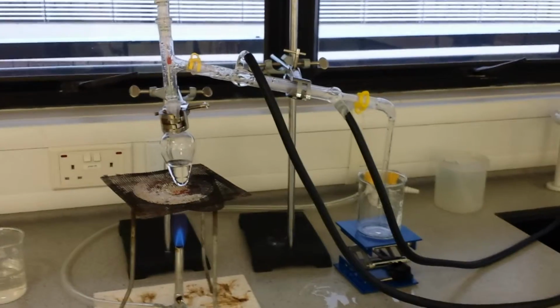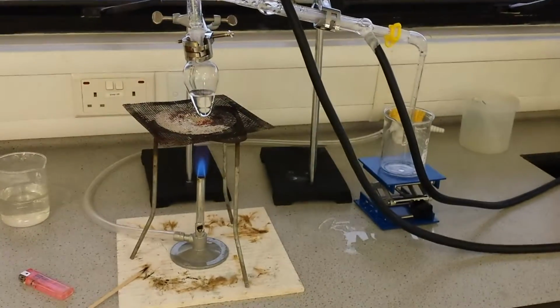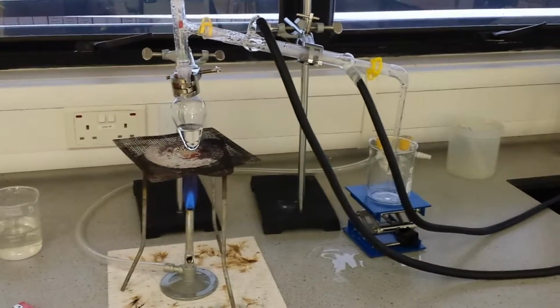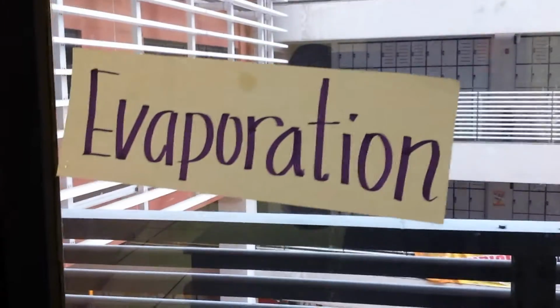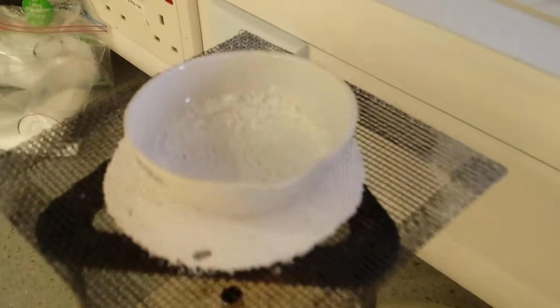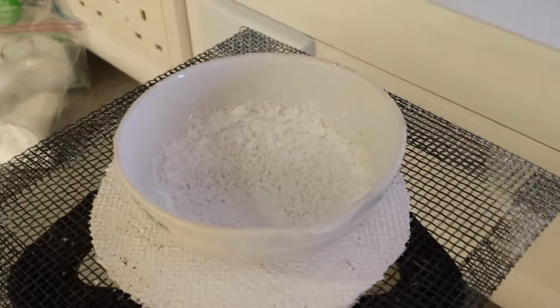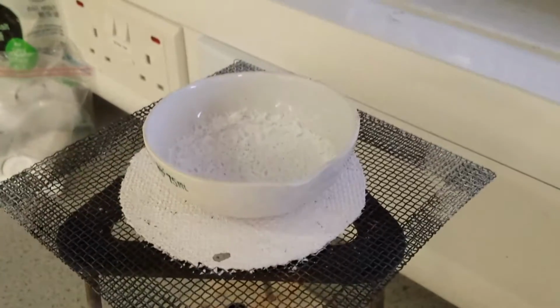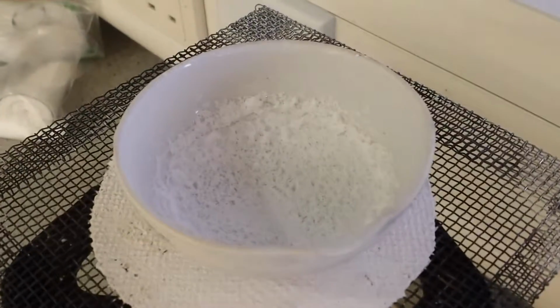Okay, so this is a distillation setup. As you know, distillation combines two changes in state of matter. One is evaporation, and you already saw this when we put salt water in it. The water evaporated because of the heat. It changed into steam and then it went into the atmosphere, and so you are left with pure salt.